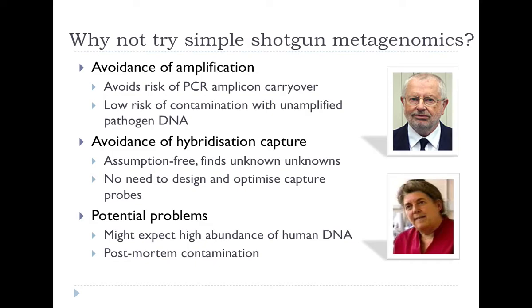You could argue that Helen gave us some samples, 200-year-old human samples, and that there will just be too much human DNA around for you to get anything useful. It may be that whatever was there in life and caused the death of the individual would just get overgrown by bacteria and fungi and so forth that grew on the corpse after death. But we tried it out.